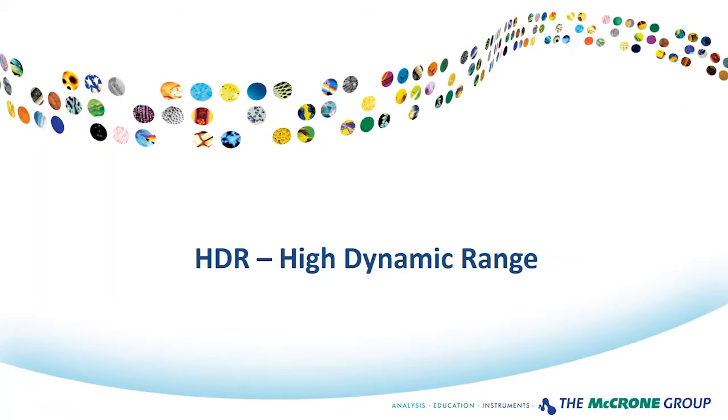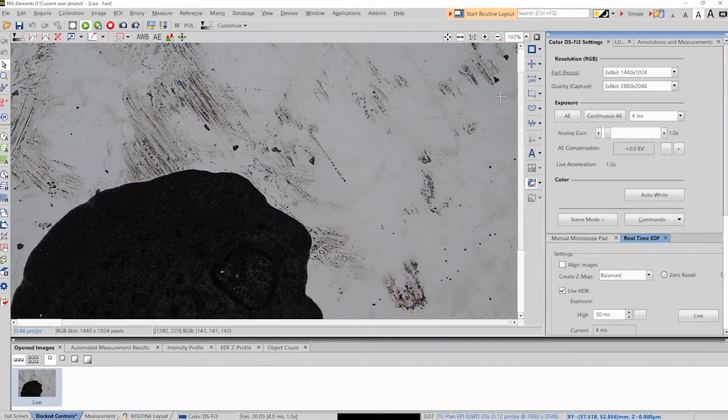High Dynamic Range Image Acquisition, or HDR, creates an image with appropriate brightness in both the dark and bright regions in a sample by combining the multiple images acquired with different exposure settings. HDR, or High Dynamic Range Imaging.